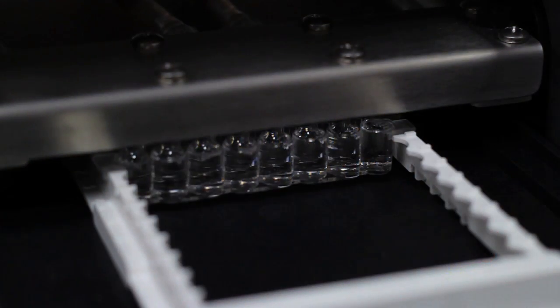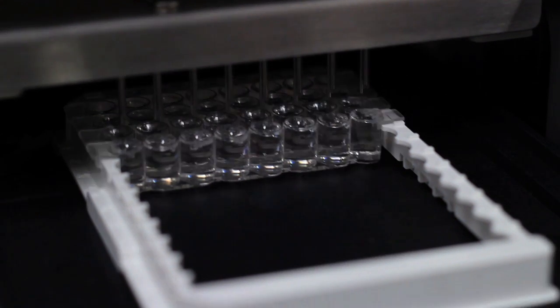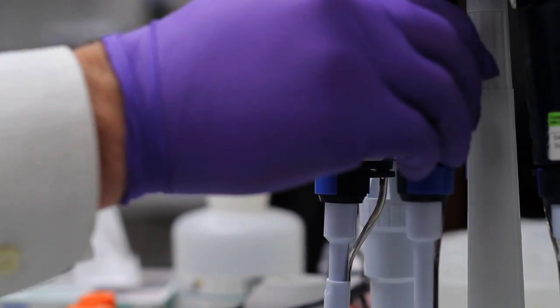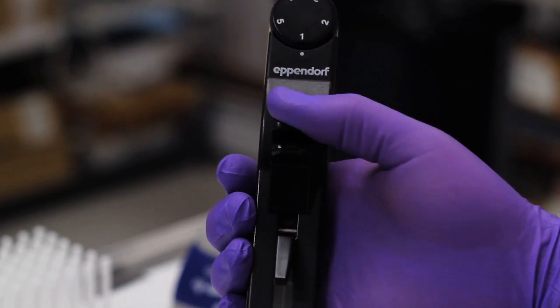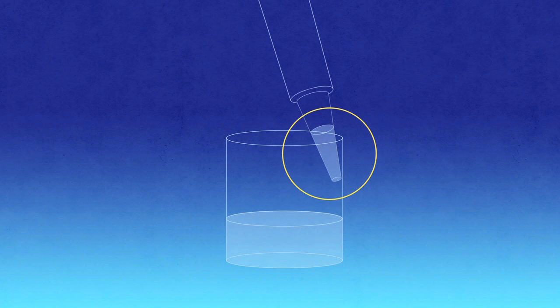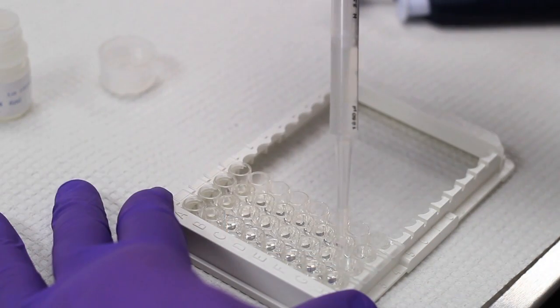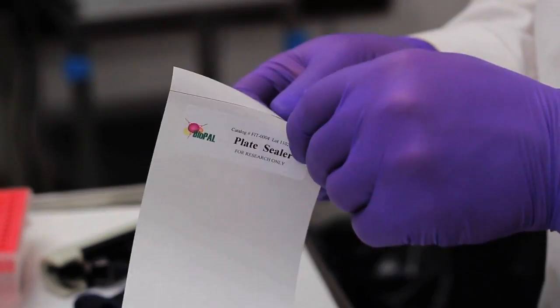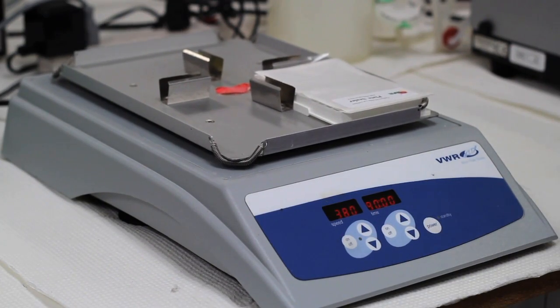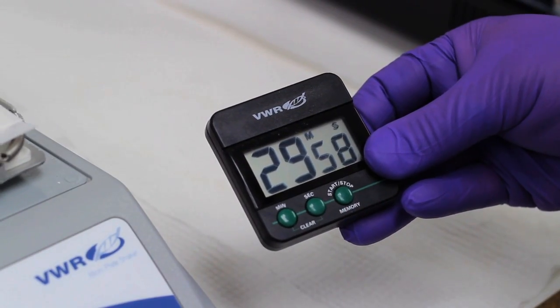After washing and aspirating the plate, it is time to add the goat anti-rabbit IgG HRP to each well. Once again, use a calibrated single channel repeating pipette, this time set to release 100 microliters. Don't forget to place the tip at the top of each well to avoid cross contamination. After all wells have been filled, use the second plate sealer to cover the plate and place it on an orbital shaker at a speed of 500, allowing the plate to incubate for 30 minutes.